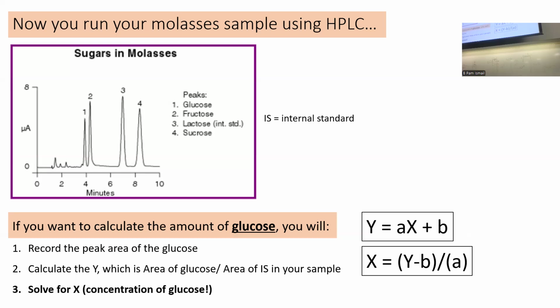Just to be real clear, the internal standard is not in the product. It's used for correction due to experimental error when you're preparing the sample. And then the external standard is in the product, but we use it for analysis calibration, to create the standard curve. It's external because glucose is not added to your sample, you buy pure glucose in varying concentrations.